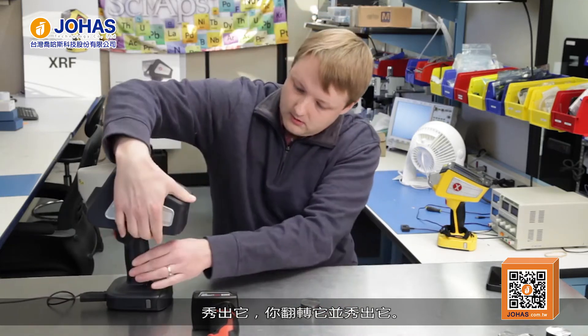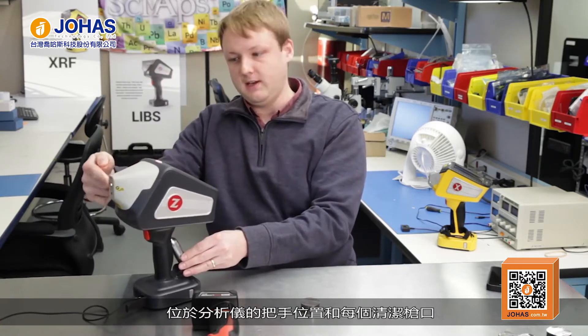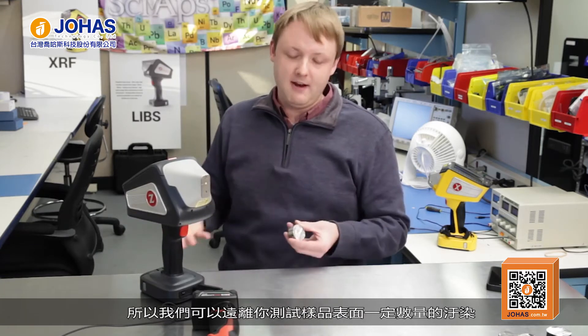We have a little argon cartridge in the handle of the analyzer, and it just purges the nose area right where the laser spark happens, right where the sample is. LIBS uses a laser to vaporize a small amount of the sample, produce a plasma, and look at the emission from the elements that are in the plasma. Because we're using a laser, we can also use that to clean the sample and get rid of some small amount of surface contamination on the metals and alloys you're testing.